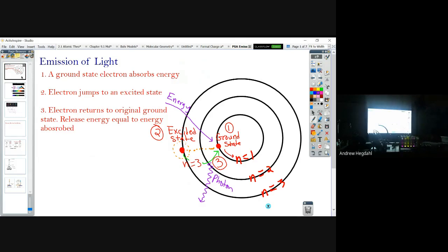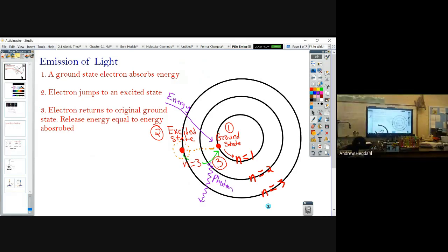All right, so when you came to class, I asked you to grab these spectroscopes. So we're going to use those now. What I want you to do is pick up your spectroscope. There's a wide end and a narrow end. The wide end is the part you point at whatever you're going to look at, and the narrow end is the part you look through. You want to hold this right side up though. On the wide end, you have a narrow slit, which you want on the bottom, and a wide vertical band that you want up high.